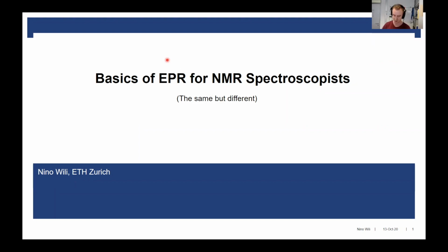So this should be a presentation about the basics of EPR for NMR spectroscopists. And from my subtitle, you could basically see that I think it's the same but different. So if you know NMR, I will not tell you anything fundamentally new, but I think there are a lot of twists and turns that took a different way in EPR spectroscopy than in NMR.